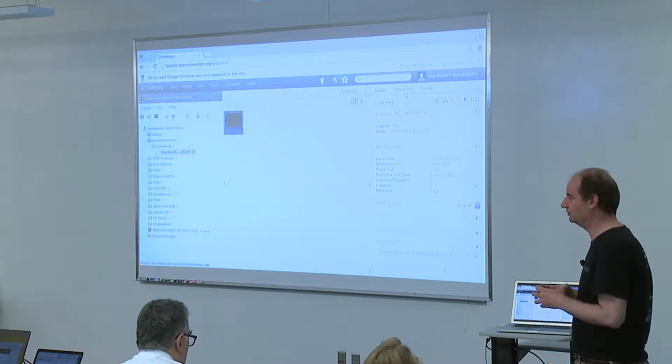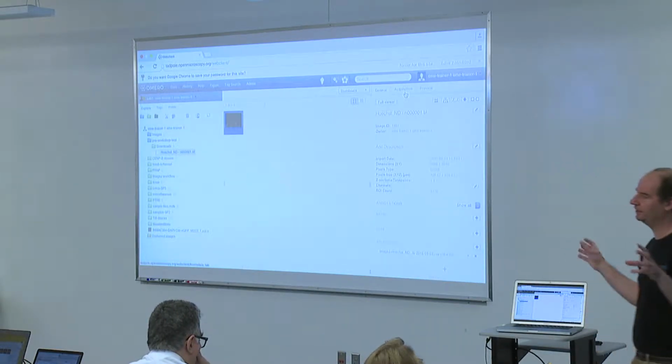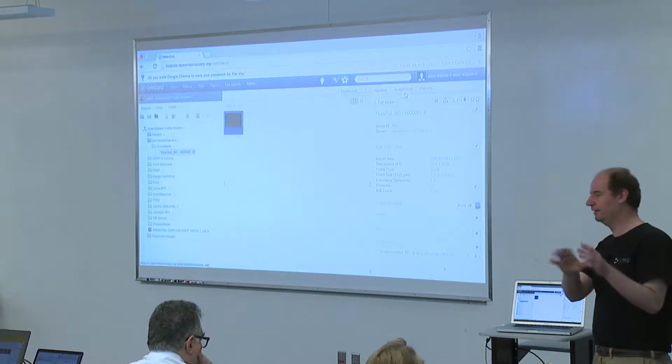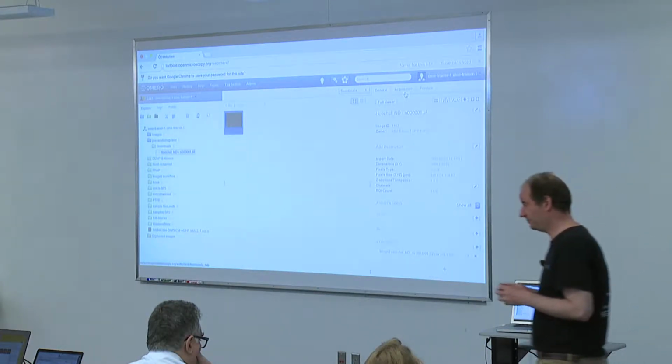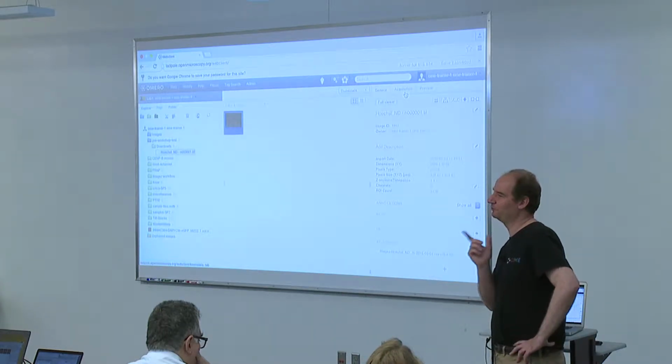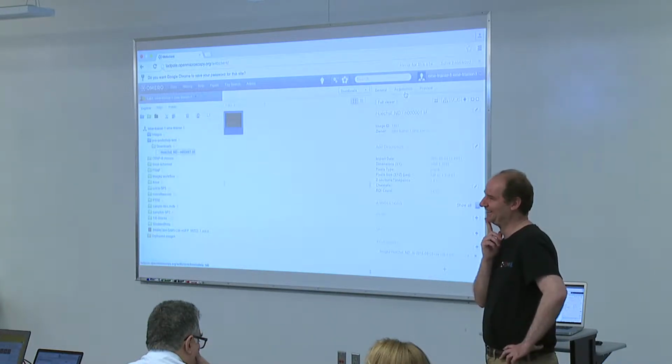So you can still do it, and you can still see your data in their original format with all the Z stacks, with all the T's and the things. I'm really sorry, I actually started to babble and completely forgot your question. Original metadata versus the new metadata.